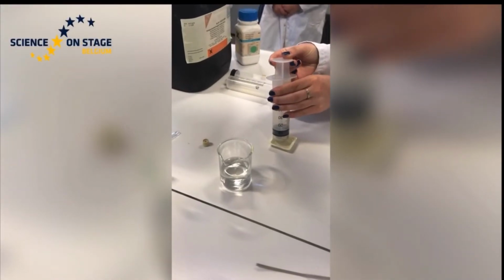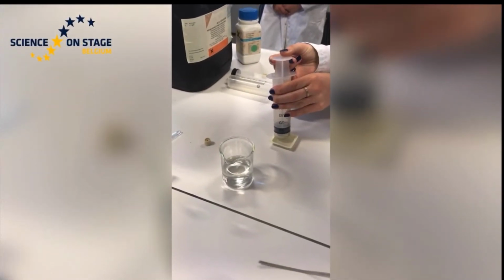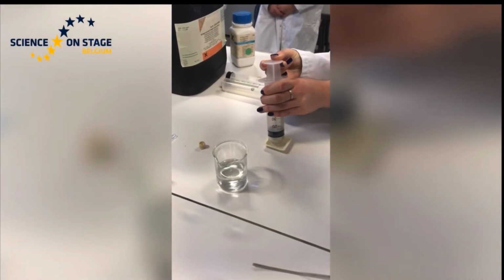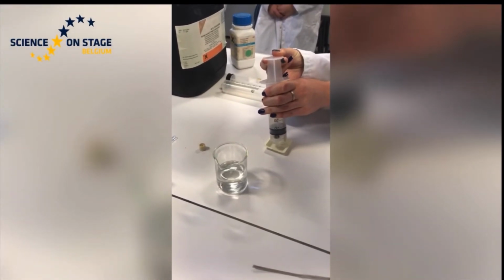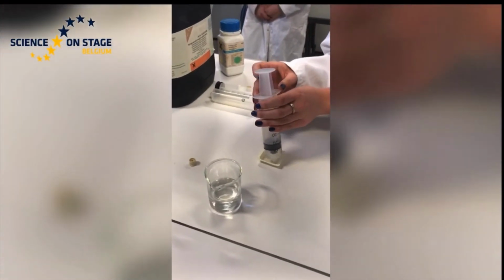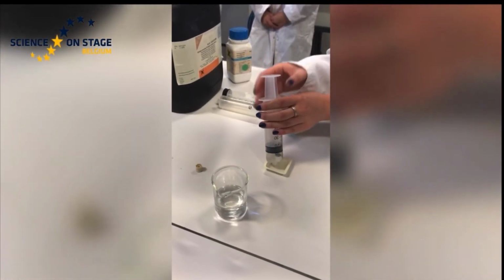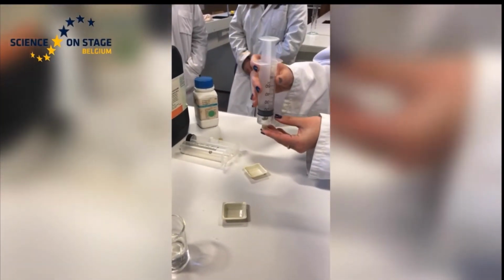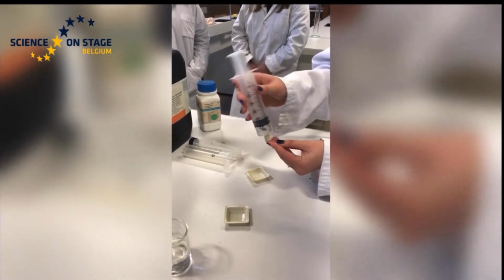The next step is to add the liquid reagent: 5 milliliters of 2 molar HCl solution is aspirated without drawing in air. The cap is put on immediately, and the reaction does not start until the small boat is tipped into the liquid.